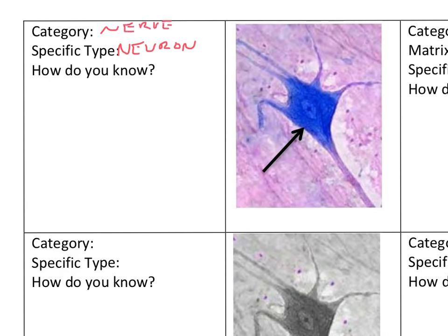You can see what's called the soma of the cell here. There is a nucleus within that soma. This is an axon down here, and these are all dendrites. We can't see the terminals because they would be way down at the other end of that axon. All this pink fuzzy stuff is going to be a combination of glial cells and just the branching of the dendrites. You can branch out outrageously through that entire area.